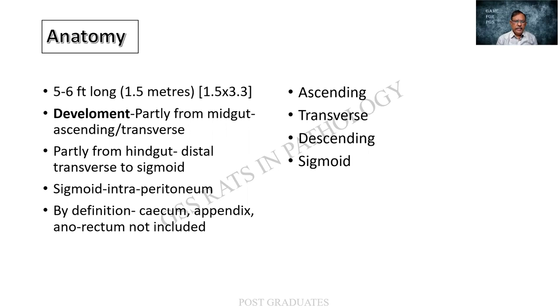By very strict definition, these parts, the cecum, appendix, and anorectum, are not involved in the colon. But for surgical pathology, it would be better that we include these for a complete examination and report.